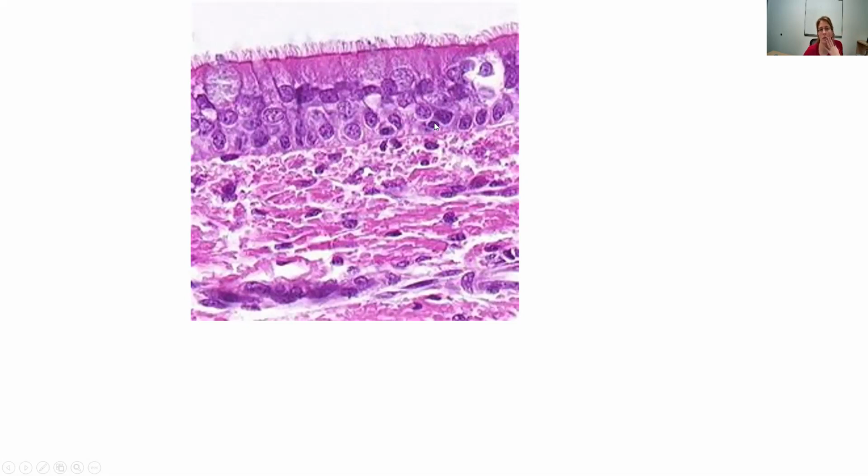All right, what else do I know? Well, this looks like a nucleus. So if this is a nucleus, this whole thing is a cell. And that looks really tall and thin to me. So it's probably columnar. Let's look at the other cells around it and see if they are the same way. Well, here's another nucleus and oh, I can kind of make out a cell right here. And there's another cell right here. Well, these are all long and thin. So I have just discovered this is epithelium because there's an edge, and it's columnar because of the shape of these cells.